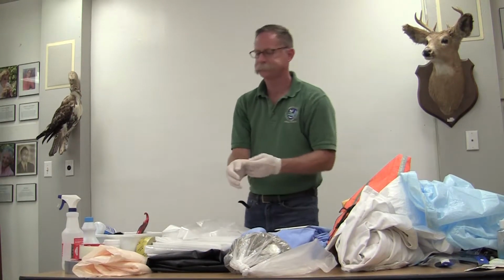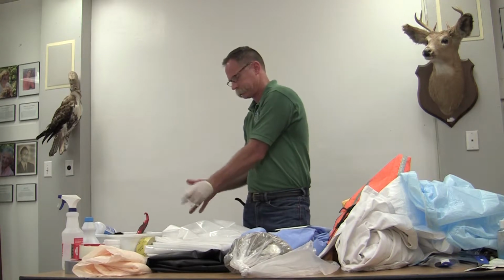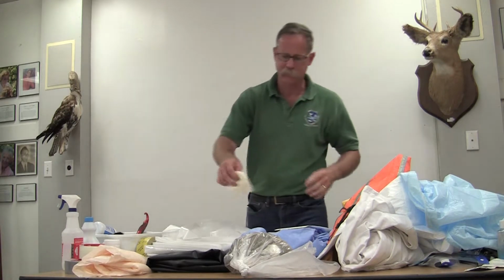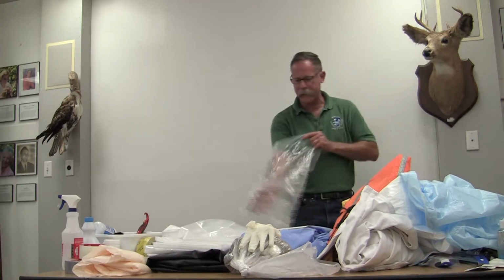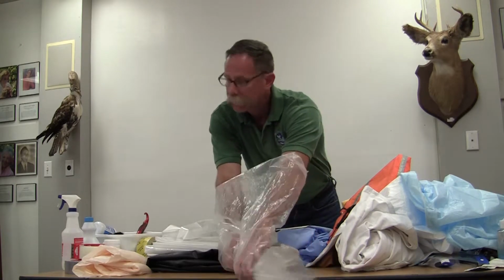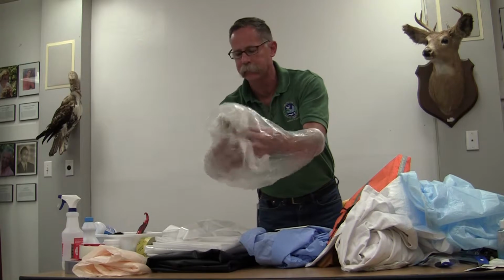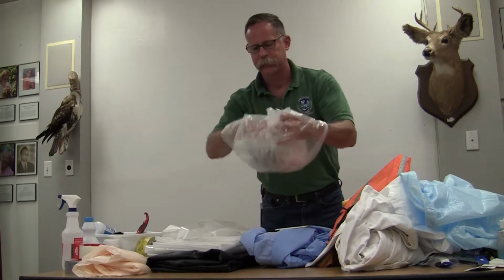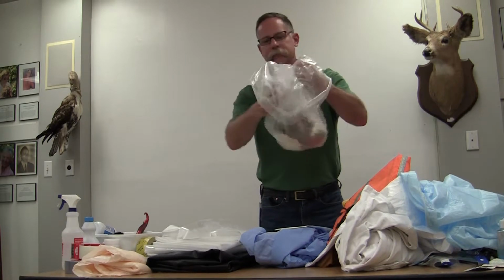Then you set it down and take your gloves off. You put your gloves right on top there. Take another similar bag and do the same thing. With a new set of gloves? You don't need a new set of gloves for the next one, because you're pretty clean already. And you're still giving yourself the same protection that dog owners have against the poop.